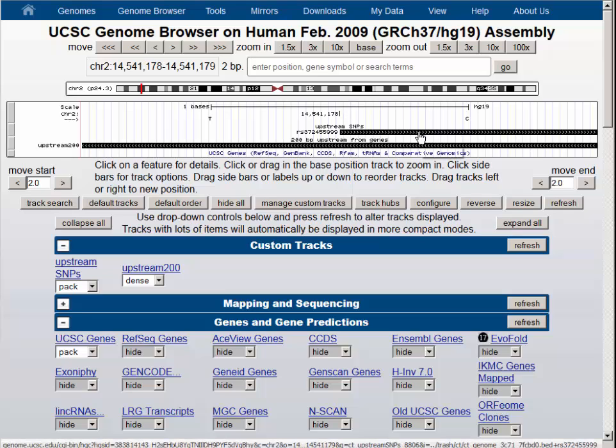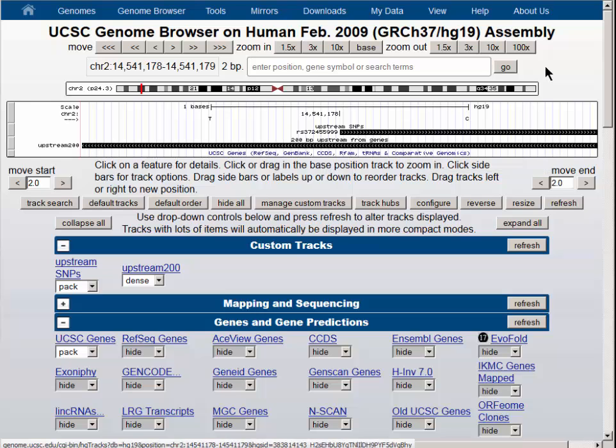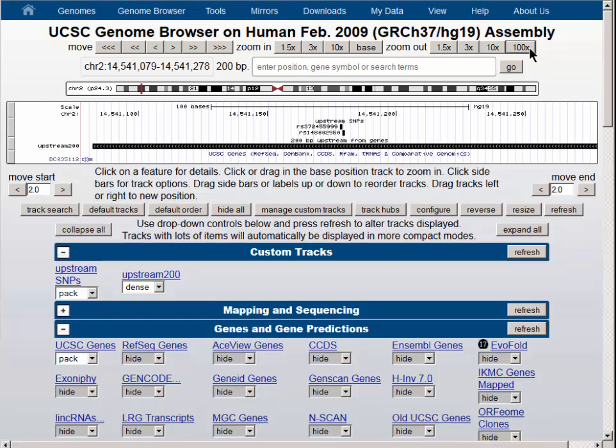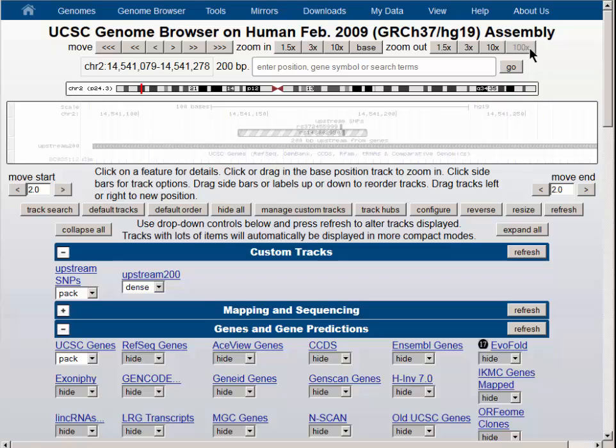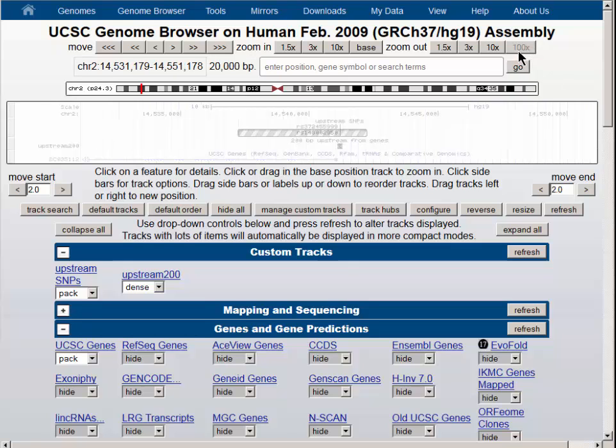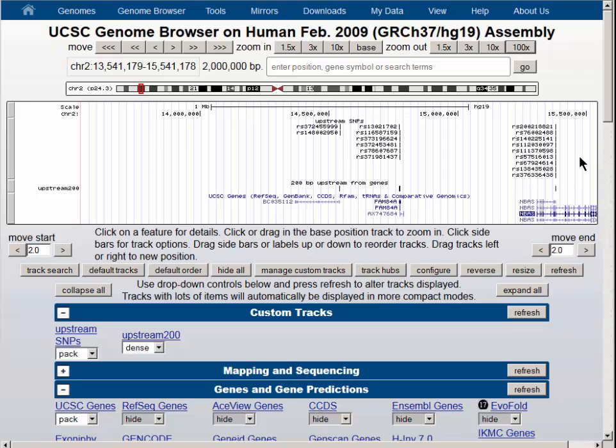Here is the one base of the SNP and here is the 200 base upstream region that includes it. A 100 fold zoom out and another 100 fold zoom out and then another 100 fold zoom out takes us to a view where we can see that our SNPs align nicely with the custom tracks for the 200 bases upstream from genes.